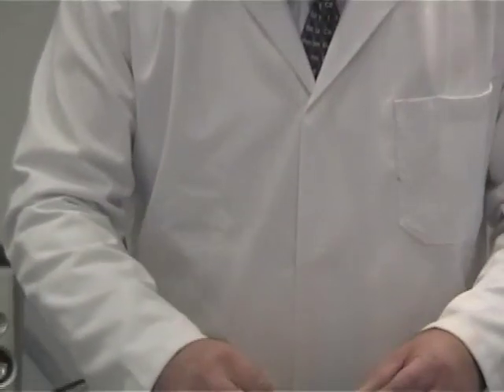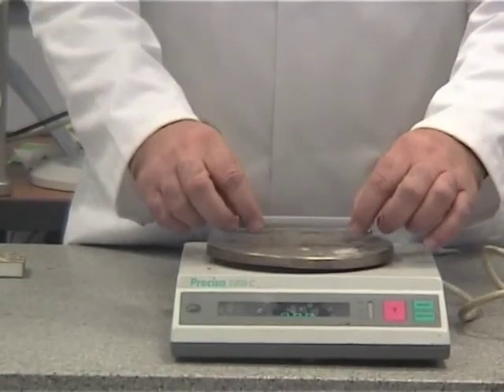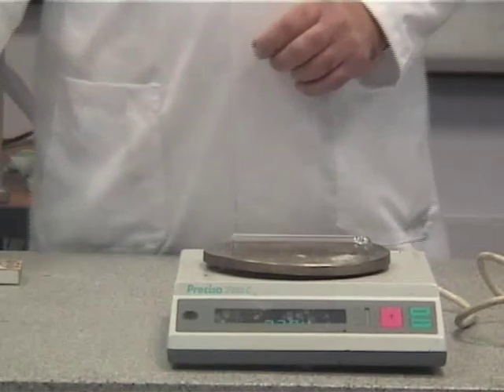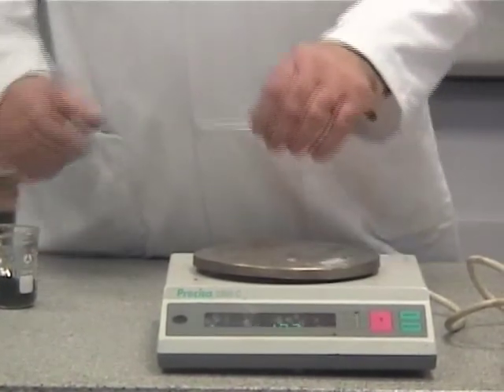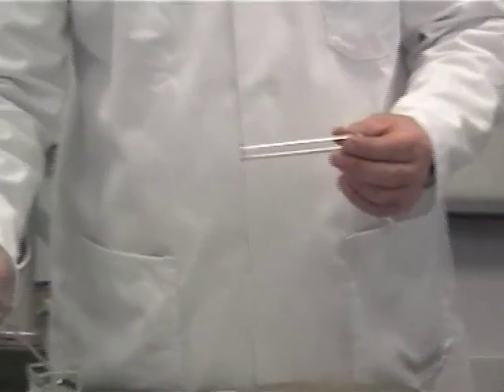And then, first thing we need to do is check the balance is at zero. We can then weigh the test tube empty. We then have to add a couple of spatulafuls of the copper oxide to the tube as carefully as we can.